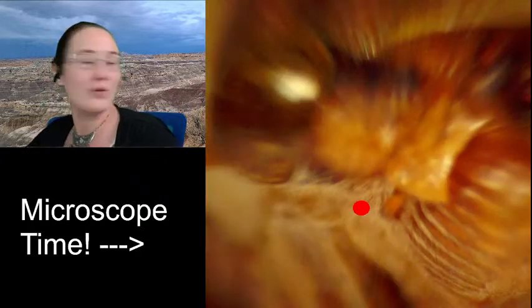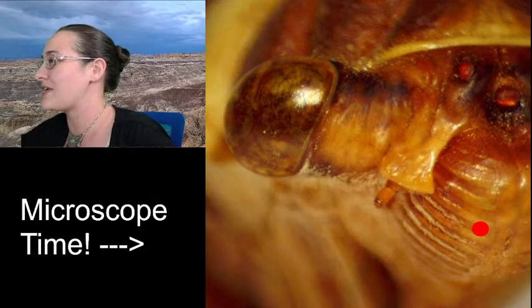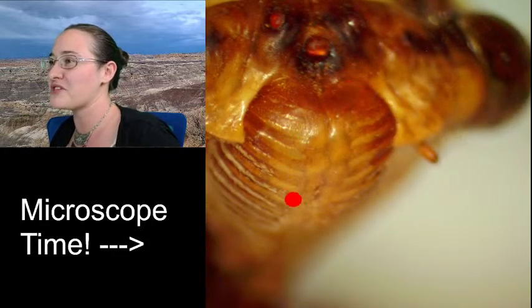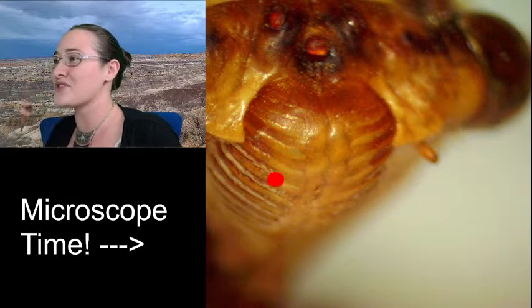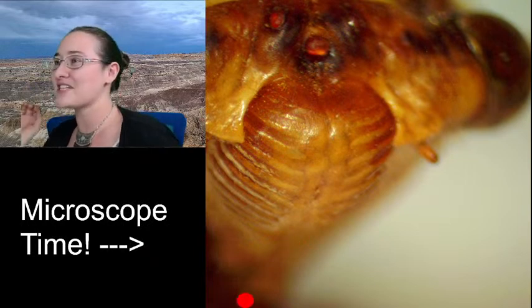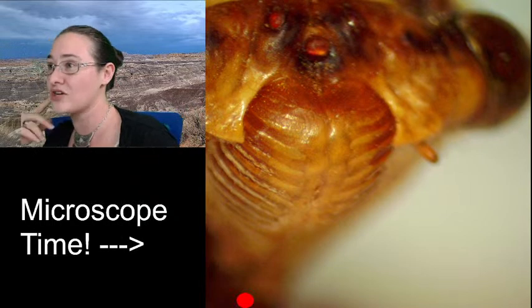But what's cool when we look at a cicada from the front is that you can see the beginning of this mouth part that we drew earlier, that triangle from the top. This is what it looks like from the front. It's got all of these ridges. And then at the base of this, it'll have its piercing and sucking mouth part that it uses to pierce into trees to drink the fluids.